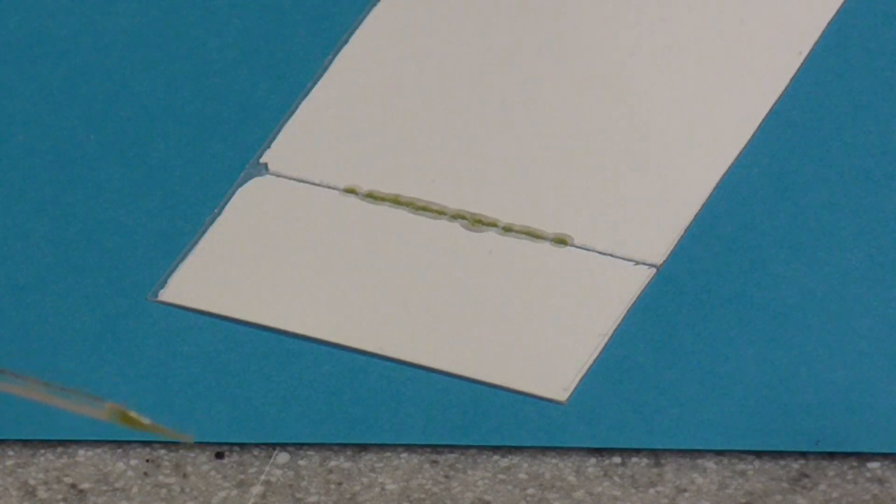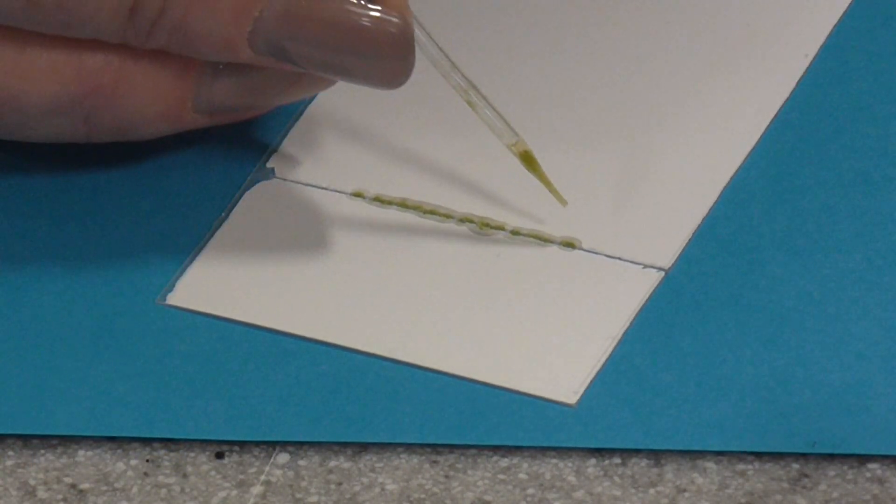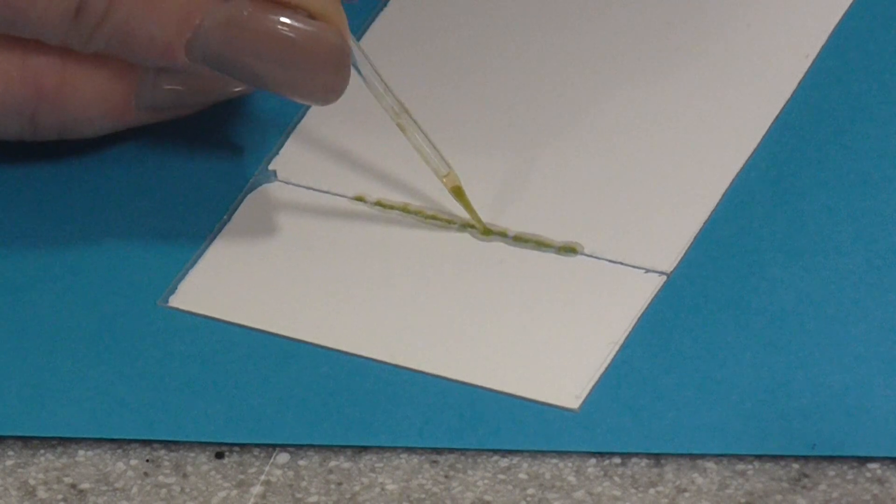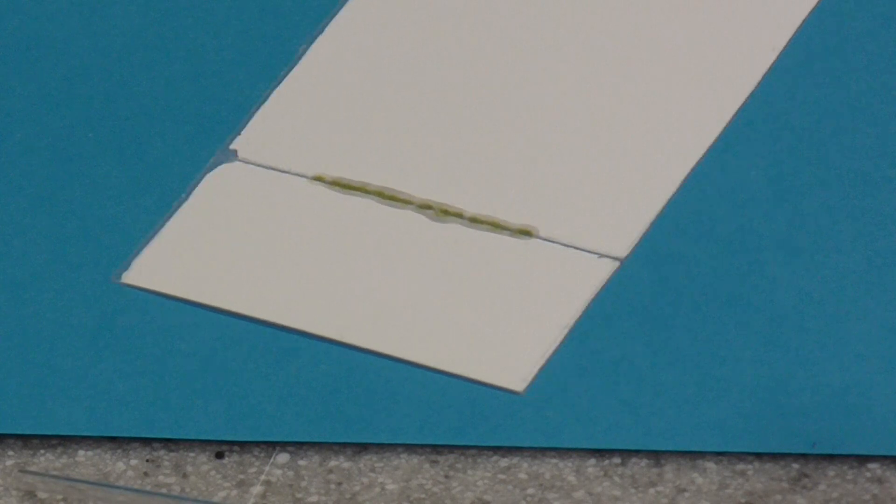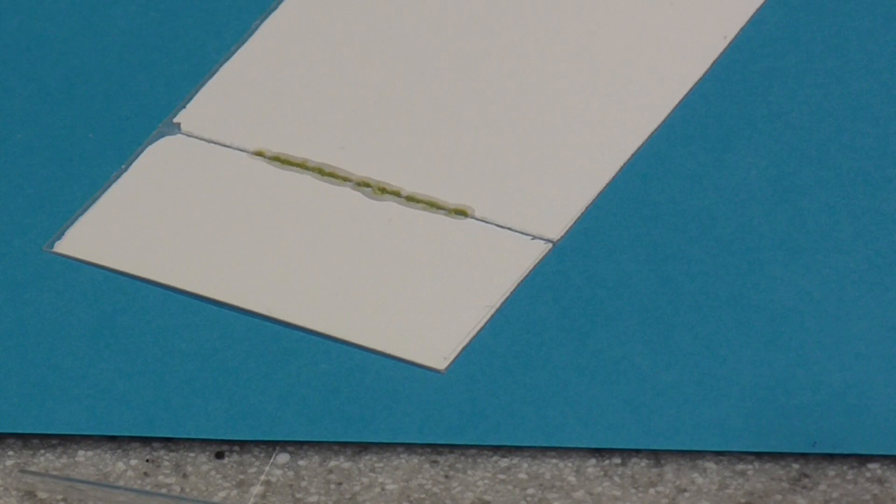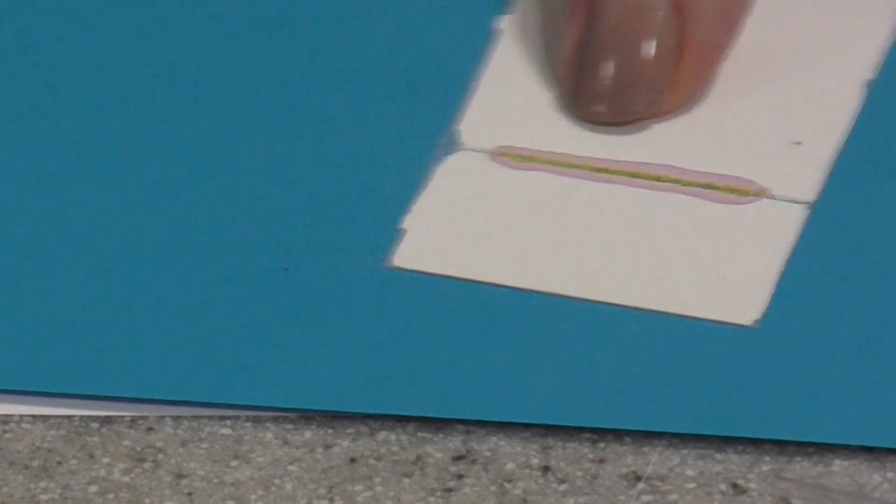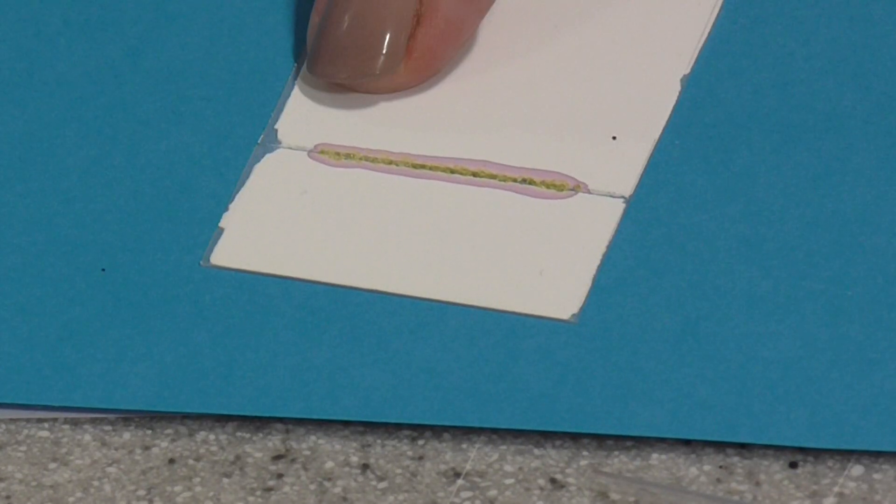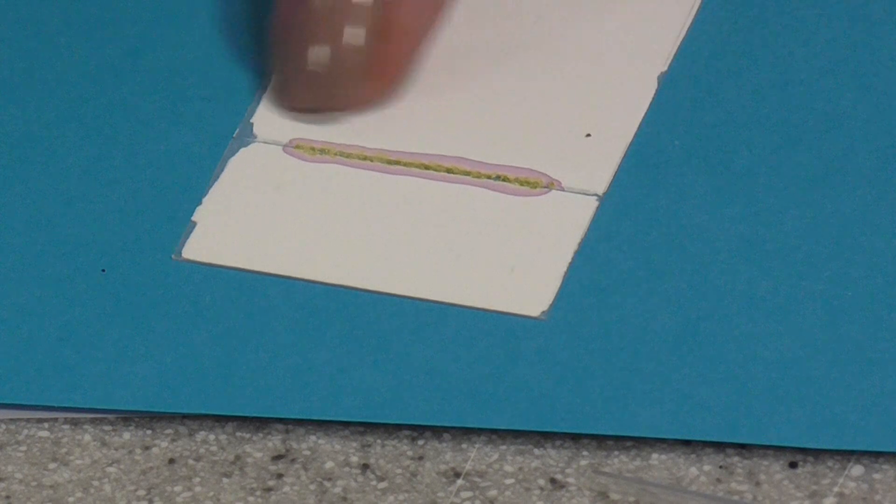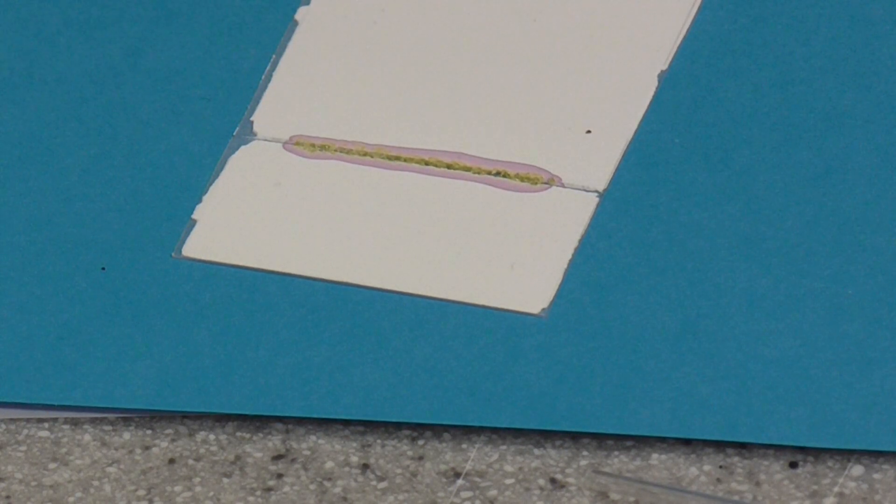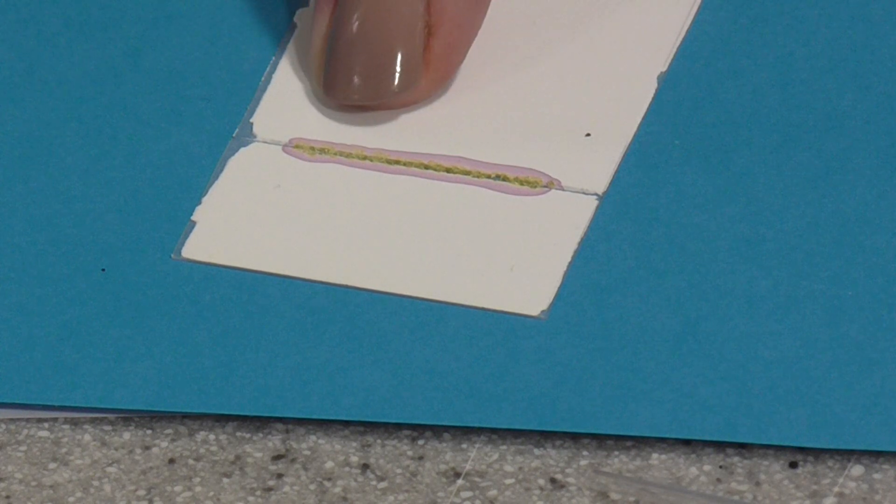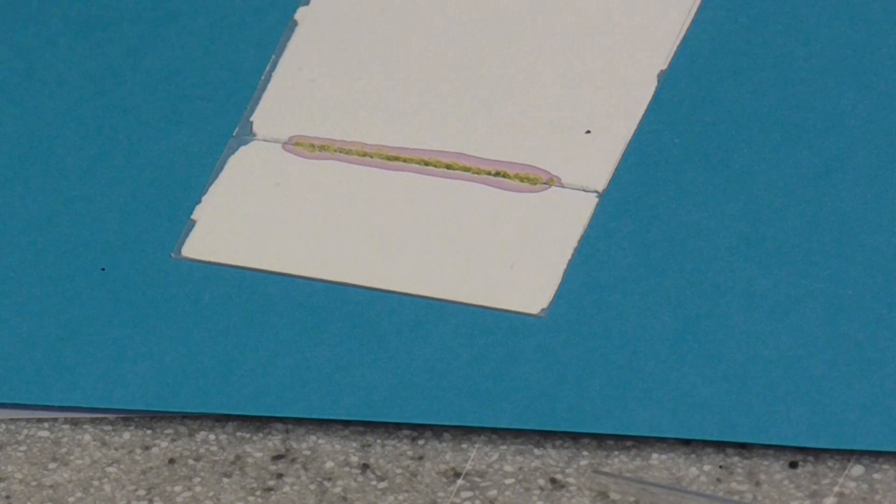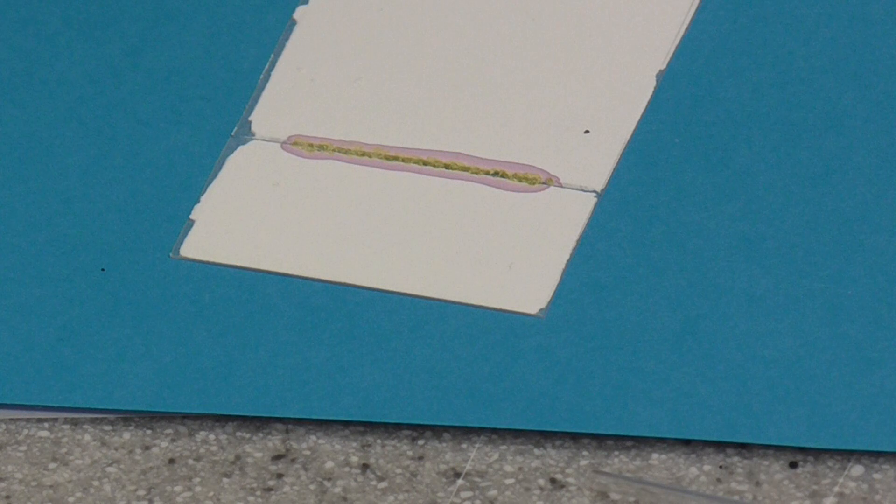You need to let it dry and then repeat the same process so that you're building up a very concentrated line of leaf extract at the bottom of your TLC plate. Here is one that I started making earlier. I've done this about six times to get a very concentrated line and allowed it to dry a little bit between each application. You need to be very patient and do this maybe 30 times so that it's very concentrated.